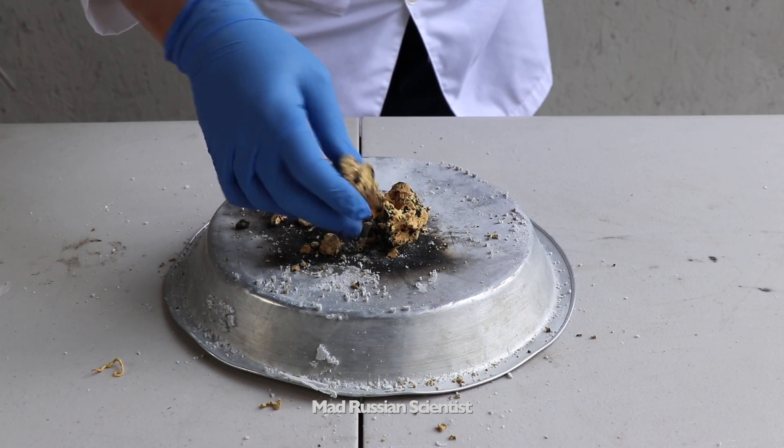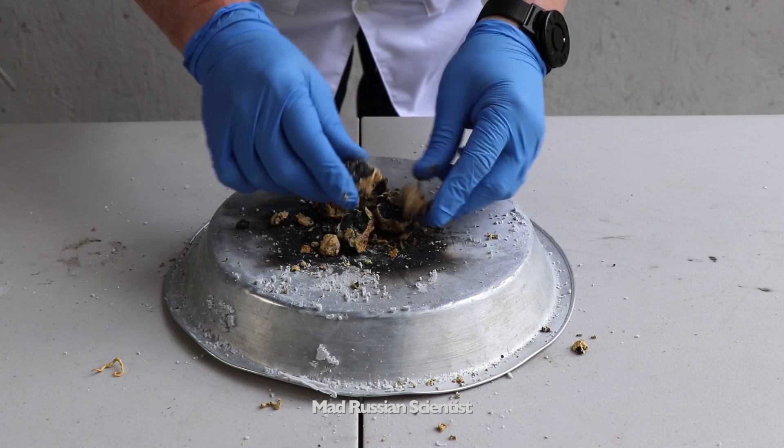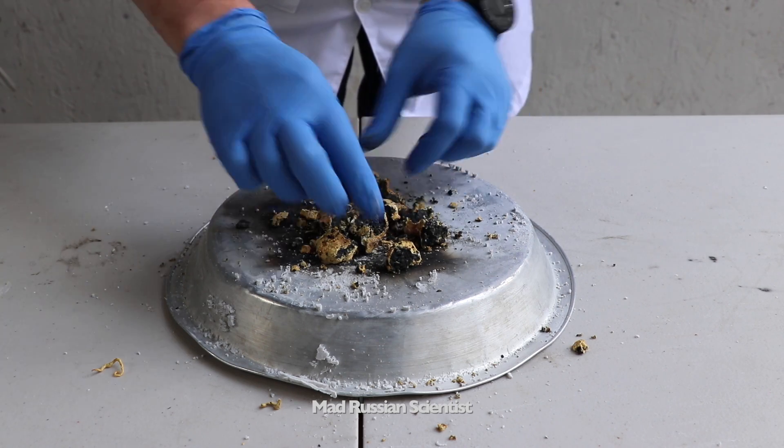That was pretty cool. It breaks very easily — check this out. And like I said, it has almost no weight. Just basically powder.